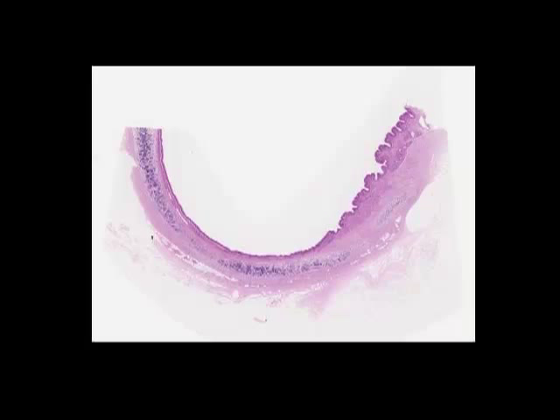This is a remade short video just to cover hyaline cartilage, and we're going to look at it in the trachea. As a consequence, we'll also have an opportunity to revise respiratory epithelium, or pseudostratified columnar ciliated epithelium.